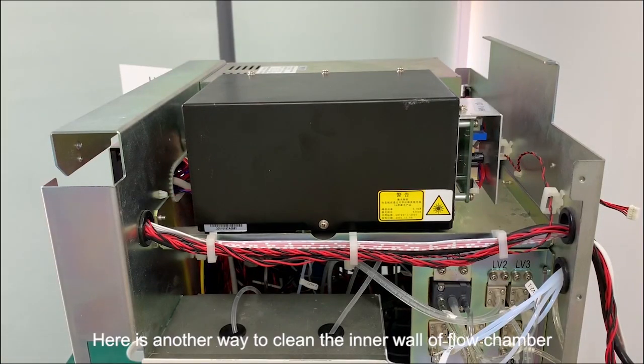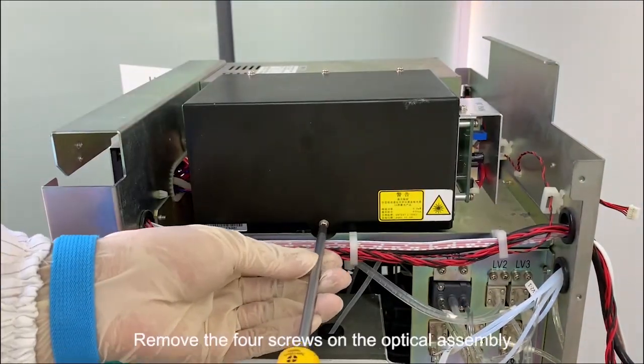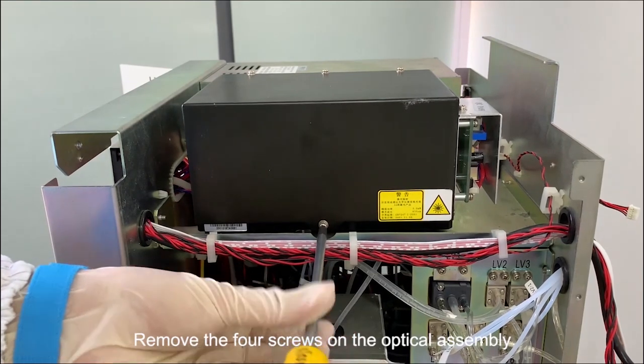Here is another way to clean the inner wall of the flow chamber. Turn off the machine and put on anti-static wrist straps. Remove the four screws on the optical assembly.